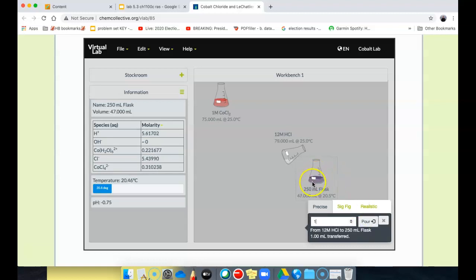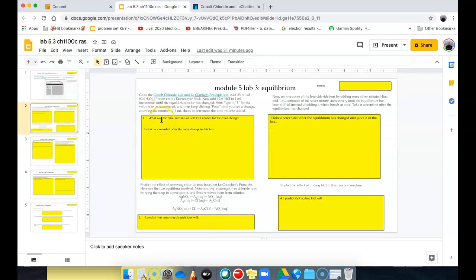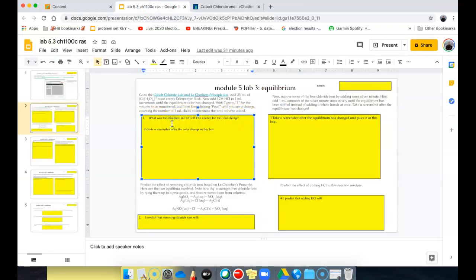Oh, that's fine. Now, can you see how everybody's going to get different answers? It's definitely a different color, but it started really a few mils in. So I'm going to say that I added from, wow, was it at 25? I'm now at 47. So I will enter that I added 22 mils of this stuff. What was the minimum mils for the color change? You know, I'm going to type in 22 ml.